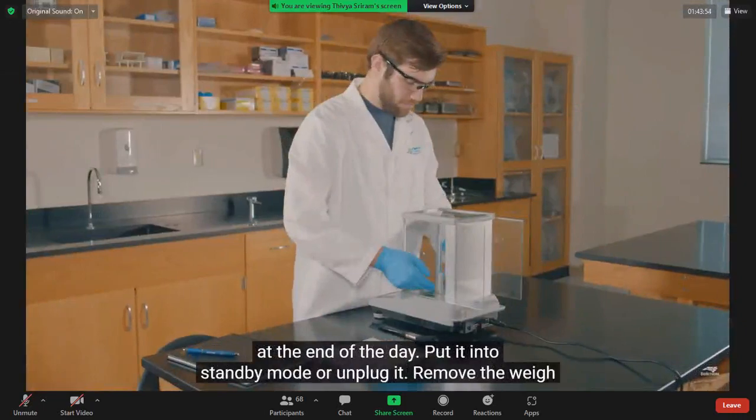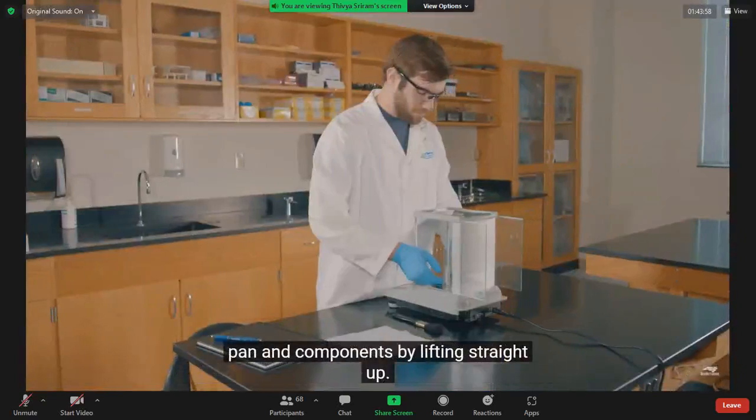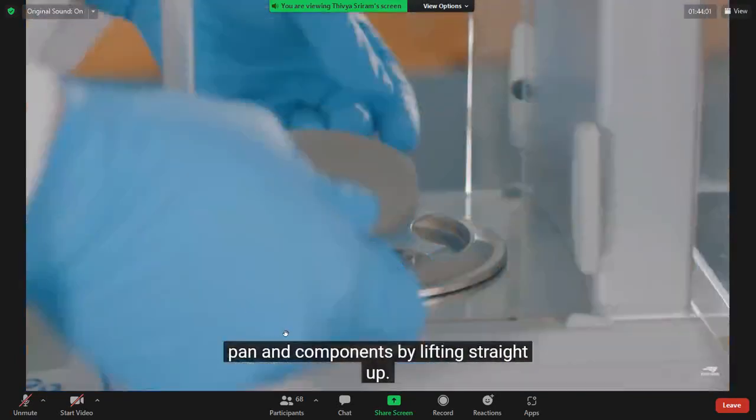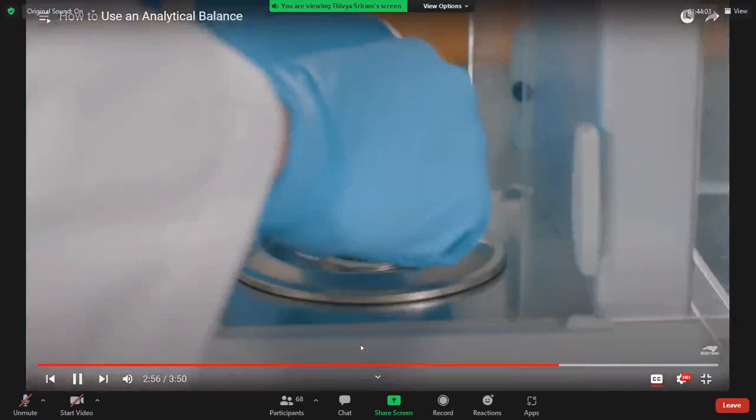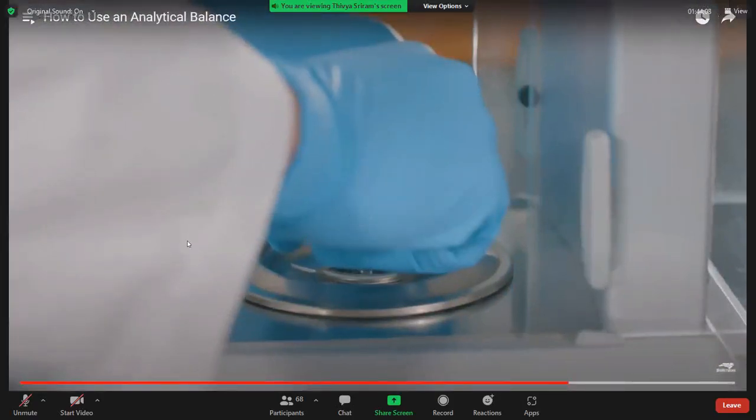Cleaning the balance is an important step, especially at the end of the day. Put it into standby mode or unplug it. Remove the weigh pan and components by lifting straight up. Each time after the measurement, you have to note the weight of the sample in your notebook. Likewise, you can change the mode to milligram, or else you can change the mode to gram. And after each use, you have to clean the weighing balance properly.